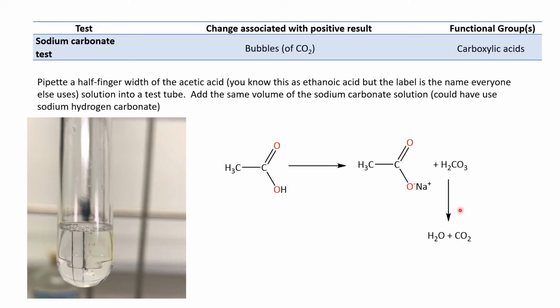Do take note, of course, that carboxylic acids are not the only acids that do this. The standard mineral acids, that's your inorganic acids, hydrochloric and so on, will quite happily bubble away when you introduce sodium carbonate to them. So you should be absolutely sure before you do this test that you have taken care of any other acid that might have been there in the preparation. But anyway, classic test for carboxylic acid: bubbles when you add sodium carbonate or sodium hydrogen carbonate.